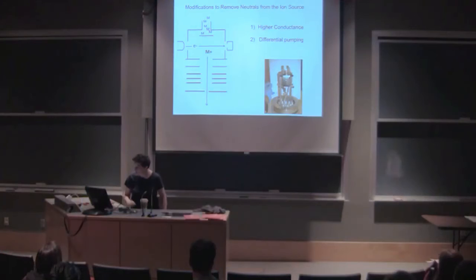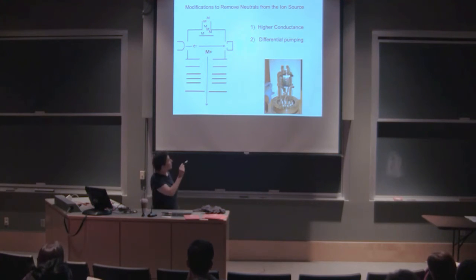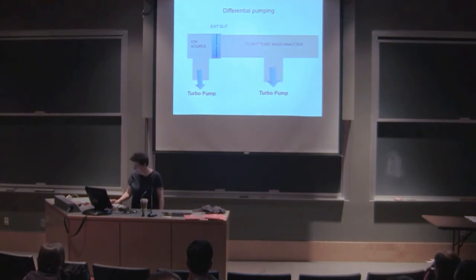It's not a new technology. It's been around a long time, but it was brought into isotope mass spectrometry in the 1980s when we began working with the continuous flow methods. When I was a student, we wanted to open up these sources. And so I literally, this isn't me, this is just a picture from the web, but I literally took the rings off the source and got a hacksaw and cut holes in them to open up the conductance of the source. They now do that for you commercially. But that was our attempt to kind of open it up, let it breathe a little bit.